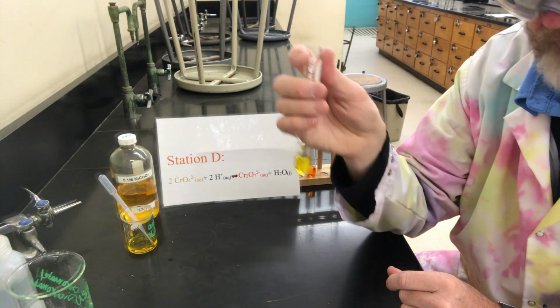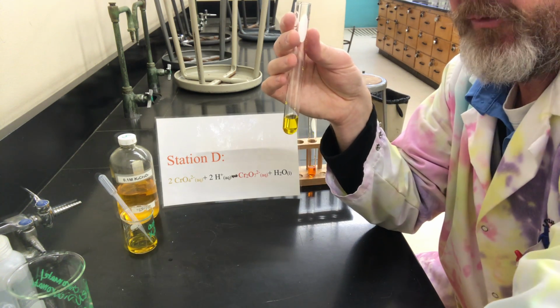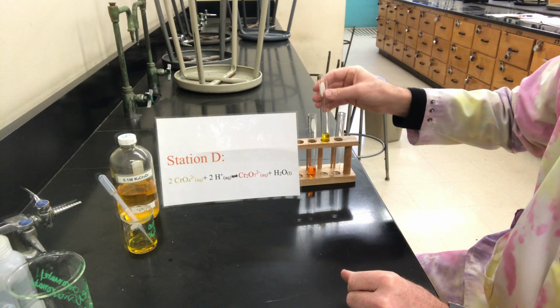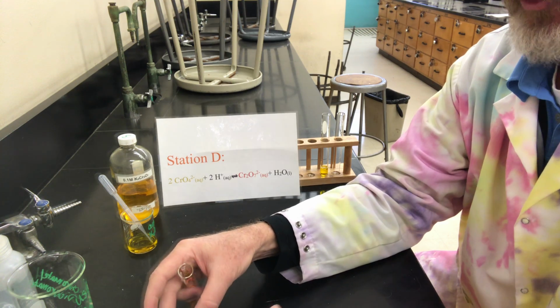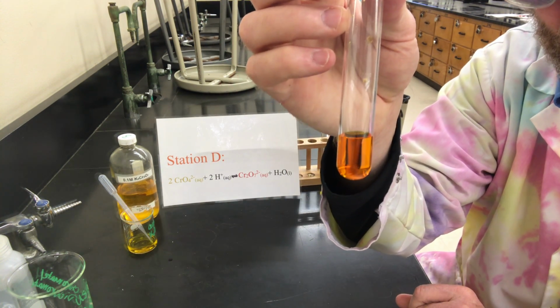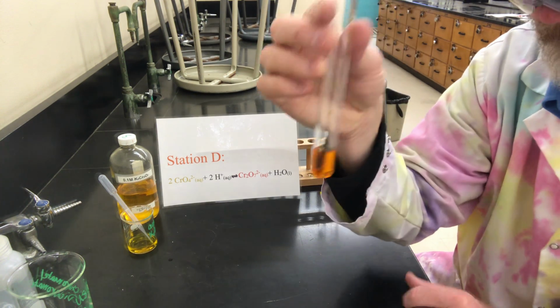And now for test tube 2, we're going to add a similar amount, 5 drops of sodium hydroxide. Whoops, I'm sorry, we want to go to the same test tube, not a different test tube. So we take that orange test tube that we added acid to. What do you think is going to happen if we add sodium hydroxide?